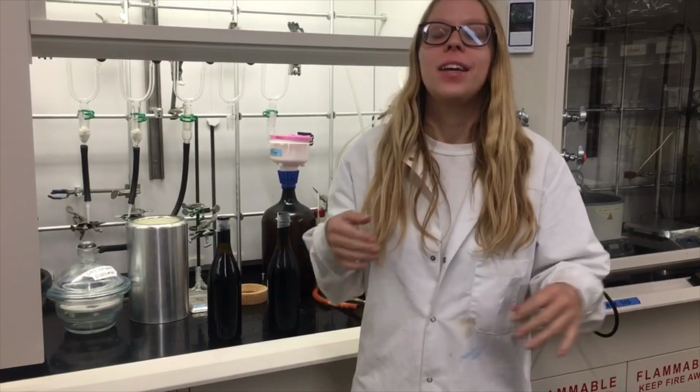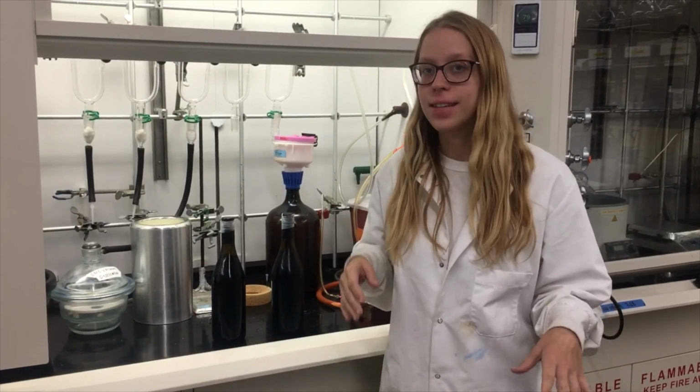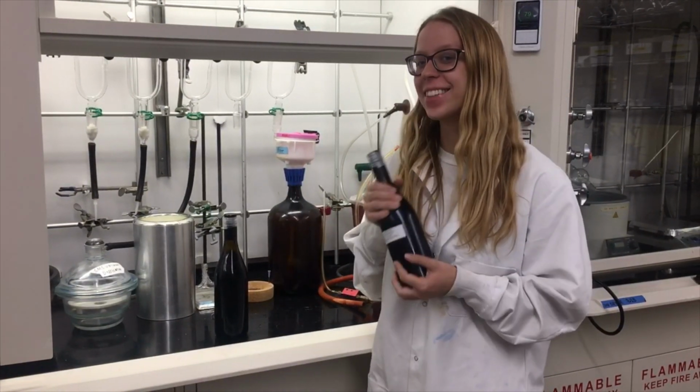So in summation, we can use our assays to chemically differentiate wines and make sure that the consumer is getting what they actually paid for.